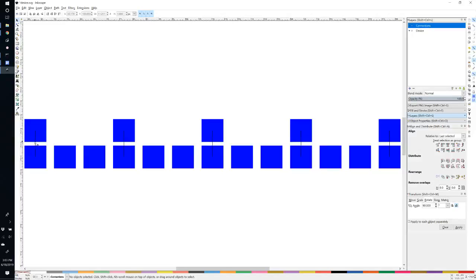To force MicroDrop to see these pairs of horizontal electrodes as adjacent, we then just need to add lines between those pairs of electrodes. To do that, we can select the Bezier Curves and Straight Lines tool, or you can copy an existing line and just rotate it. I would recommend drawing approximately from the center of the electrode or slightly over from that. You can hold the Control key to lock it to be a straight line, and then double click to end the line.